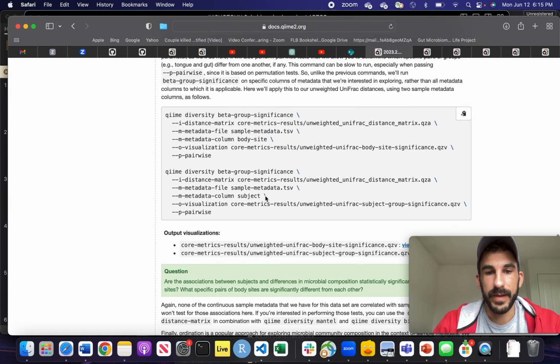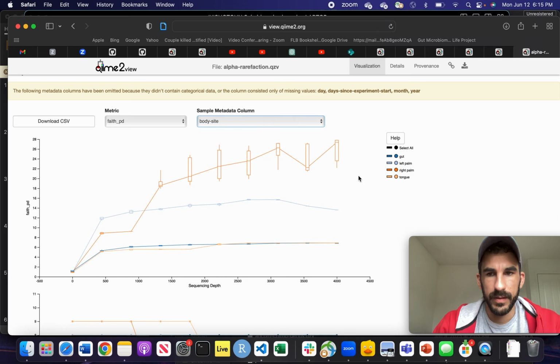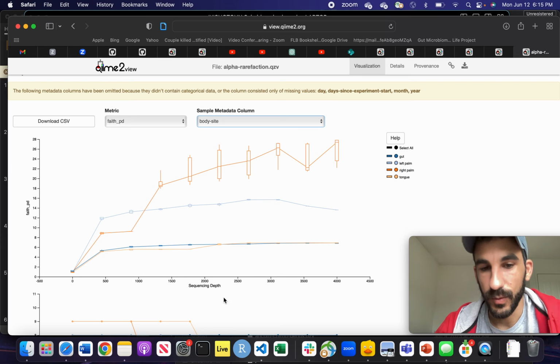And so this alpha-rarefaction curve is a good way to help you with that number. So this is the tutorial data, and we can see at 1,000 we have a certain diversity, right? And it's actually kind of problematic because if we go up to 2,000 reads, we see that there's a bunch of diversity that's not being captured, right? Ideally, you want things to level out where you had determined your cutoff, which was 1,000, right? So let's see where ours cut off.